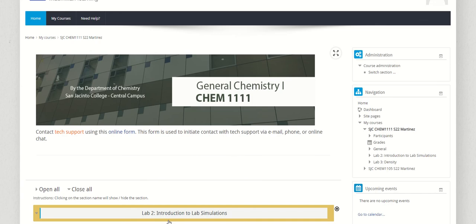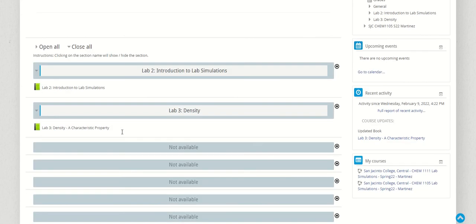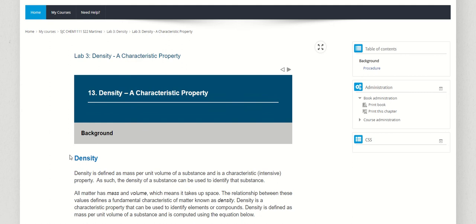And now this is the Hayden McNeil site, okay? So you completed lab 2. This right here is lab 3. It should be showing by the time you're watching this video. And you open it up you can just click here, or the little green notebook. Don't worry that it says 13. I always customize everything to make sure that it has the correct lab number, so just ignore that 13.